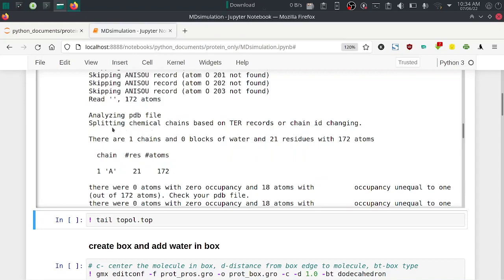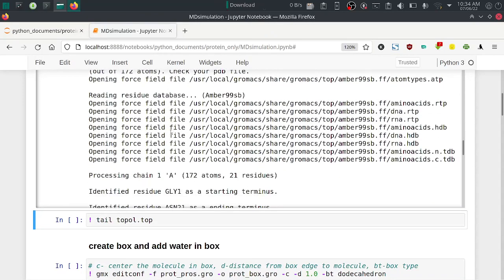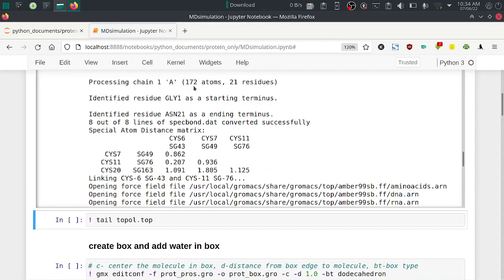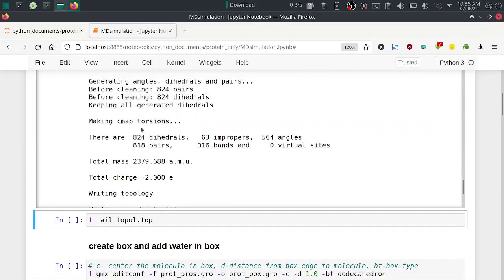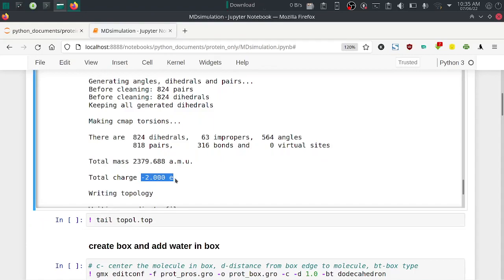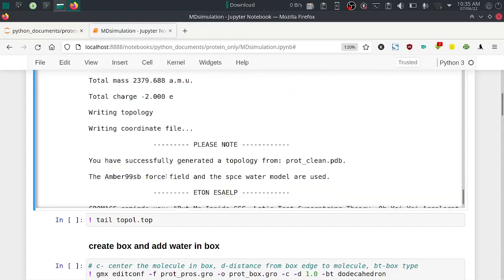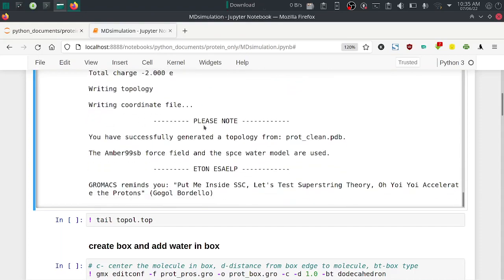There is one chain with 21 amino acid residues — glycine is the starting residue and Asn21 is the ending residue. The command completed successfully, writing the topology. The total charge is -2, which means we have a charge of minus 2. We need to neutralize this charge in the add ions step.